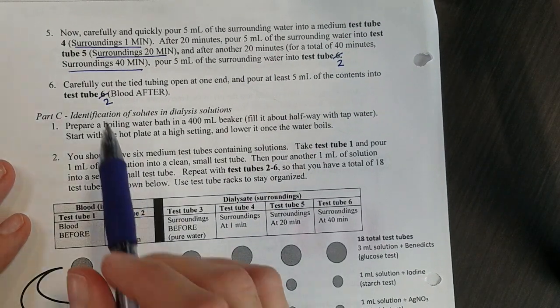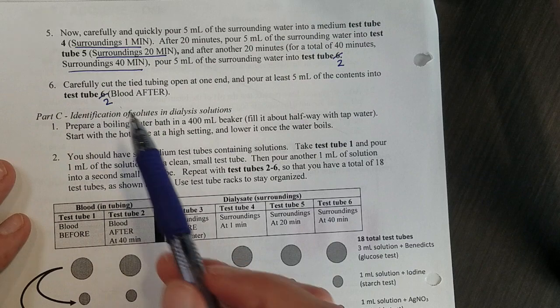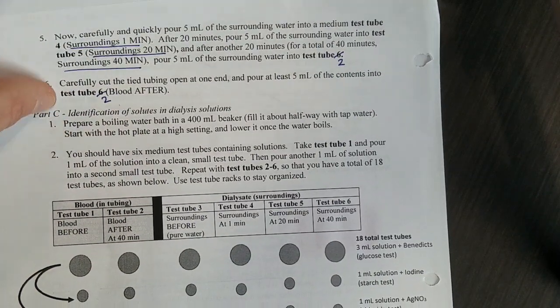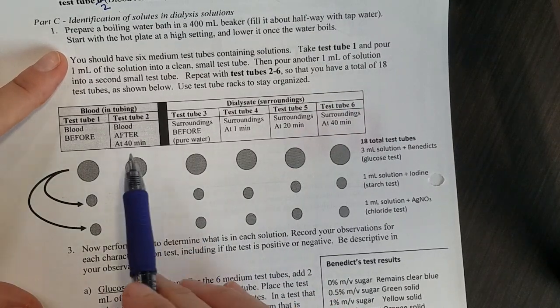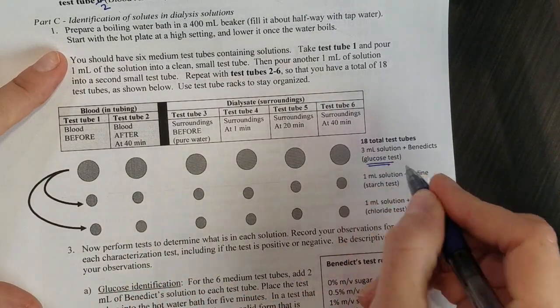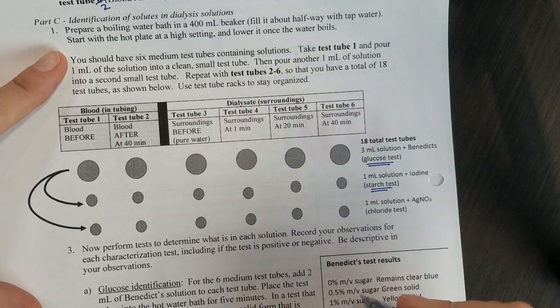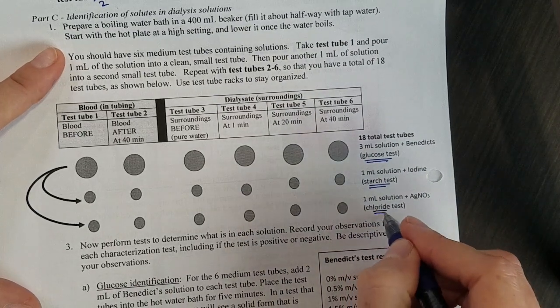In part C we're going to identify what was in the dialysis. You're going to see as the lab is worked that there are a lot of test tubes. We'll have big ones for the glucose test and then a small set with starch and a small set with chloride.